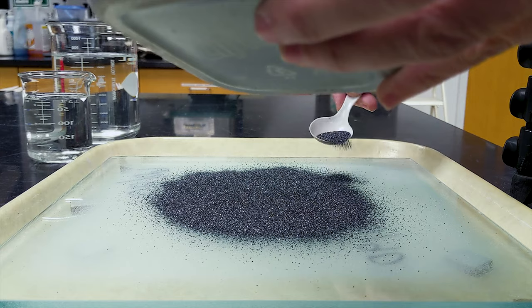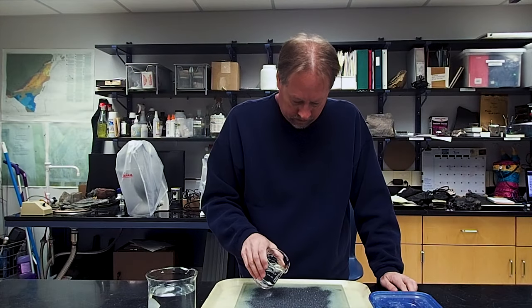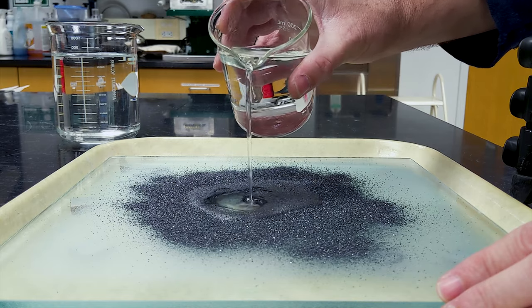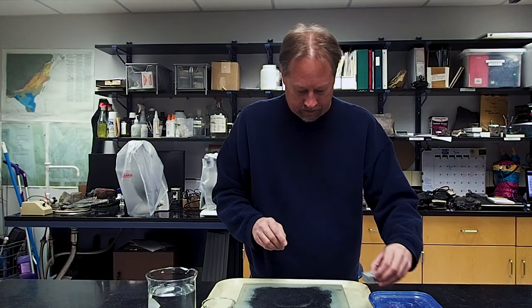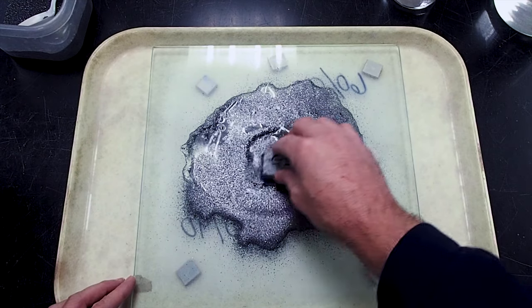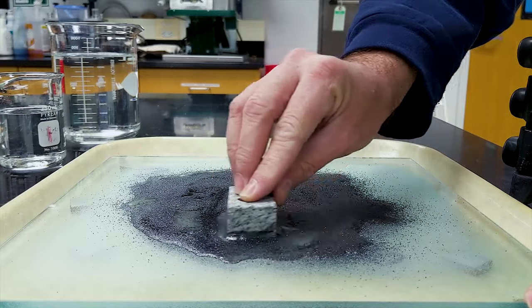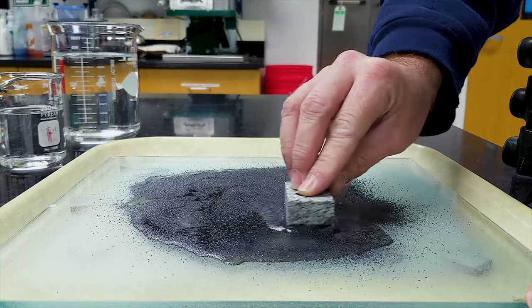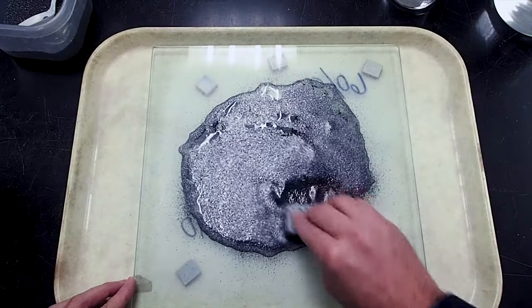Sprinkle a spoonful or two of grit onto the glass plate and then add some water. Next, begin to mix the water and grit together with your rock chip to create something of a slurry. The mix should be watery enough so that the grit lies flat, but not so much that the water is running off of the plate.